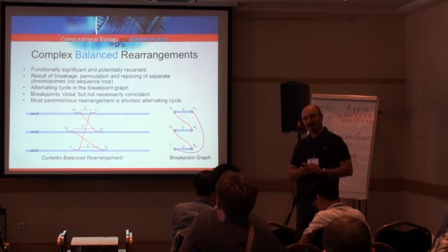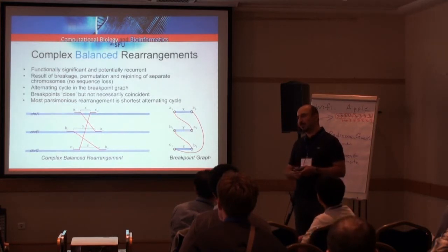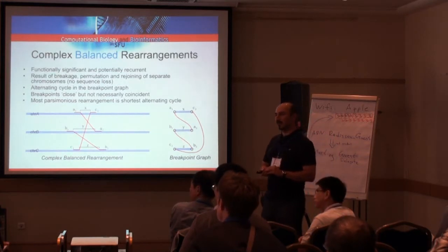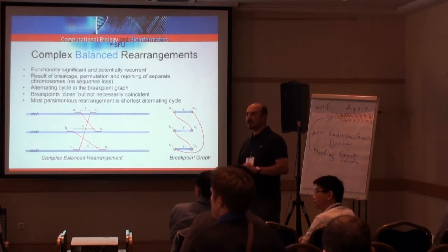But how many times is the image data more than the string data? The trade-off looks like, in the Genome Sciences Center in BC, they are keeping the samples instead of the image data now. They're getting rid of them. So I guess it's more cost-effective to just keep the sample. I think nobody's keeping the images anymore. They used to, up until very recently. But it's a good question to ask.